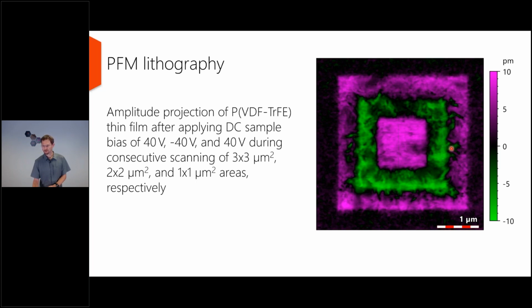So even though the movement was turned around there, you see that the repolarization into the green is extending towards the outside. So you can nicely study these borders between oppositely polarized domains and the shape of the domains.